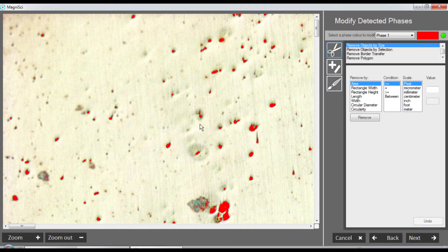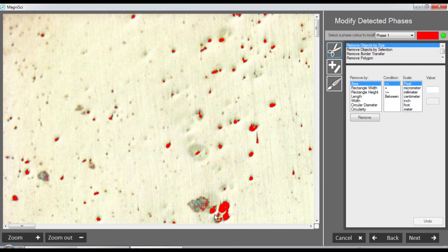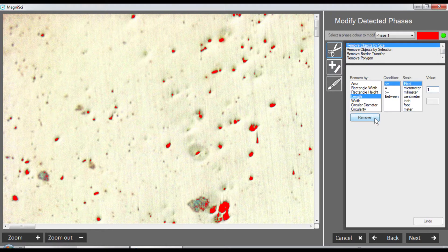These are the particles, but there are also objects that are only a few pixels in diameter that we don't want. The first filtering we do is remove objects by size - we go to modify detected phases. In this case I say objects below one pixel in length can be removed, and a bunch of particles are being removed.